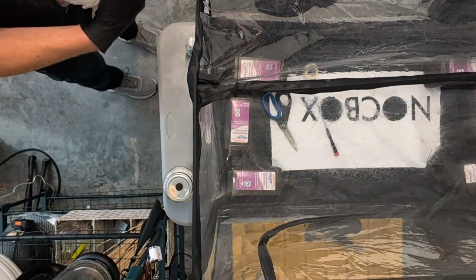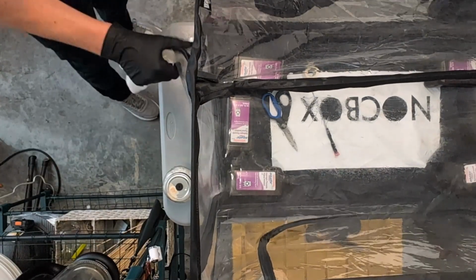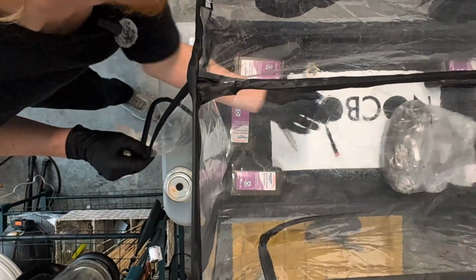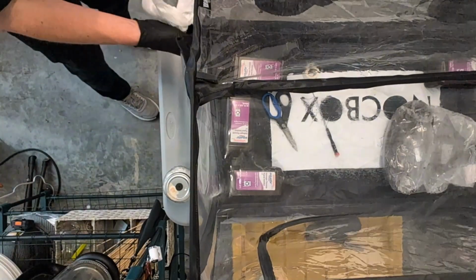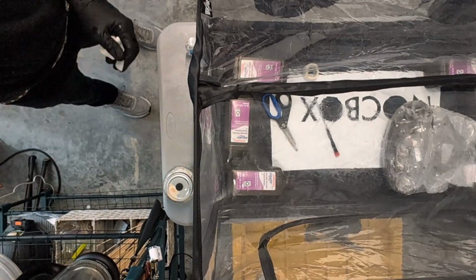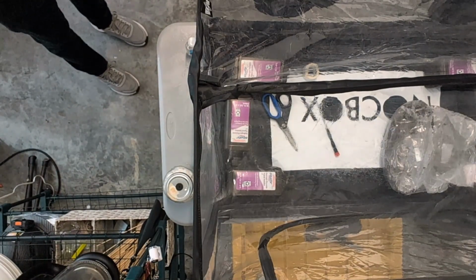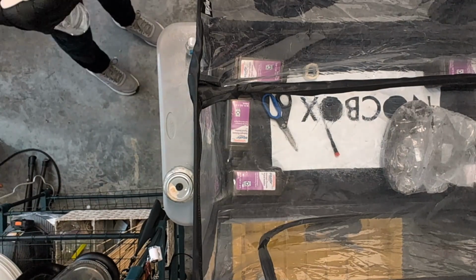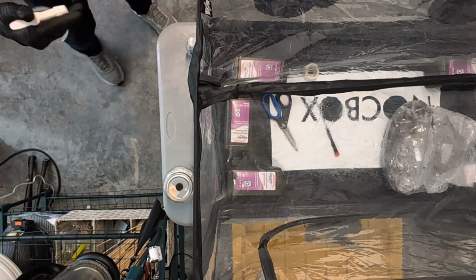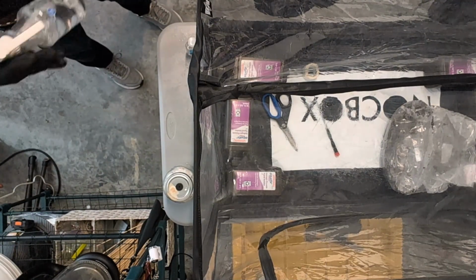I'm going to do more sanitizing once it gets inside the still air box, but like I've said, I've been fighting contamination so much lately that perhaps I'm being overly cautious now, but I don't want to say overly cautious. I'm probably starting to approach the appropriate amount of caution that I should have been exercising since the beginning, but wasn't. And I was having a lot of success.